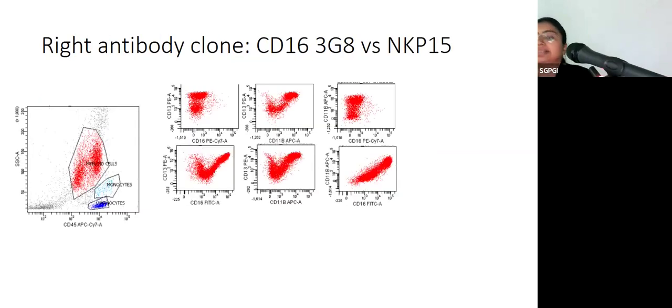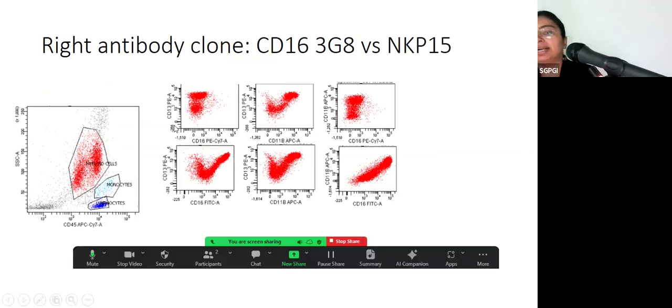Now, this is the example that I was giving you, and this is something that I made a mistake in the lab. So what we wanted to do was, we had CD16 antibody lying around with us, which would react very well with NK cells and was being used in the lymphoma panels. So we started to do the MRD assay, picked up everything that was in our fridge, conjugated that CD16, used that CD16 antibody, and our data looked like this.